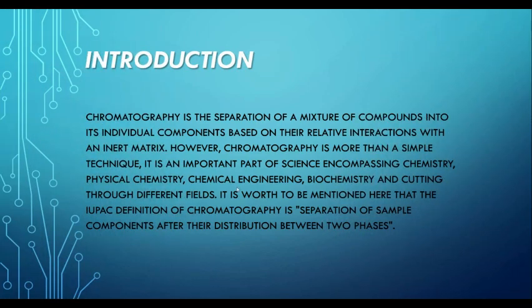Chromatography is the separation of a mixture of compounds into its individual components based on their relative interactions with an inert matrix. However, chromatography is more than a simple technique, it is an important part of science encompassing chemistry, physical chemistry, chemical engineering, and biochemistry, cutting through different fields. It is worth mentioning here that the IUPAC definition of chromatography is separation of sample components after their distribution between two phases.